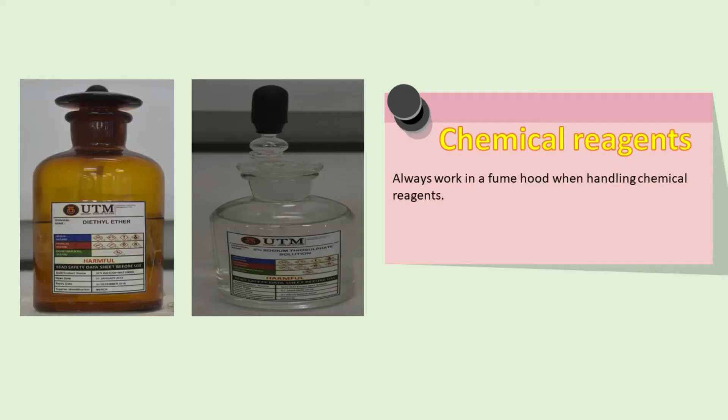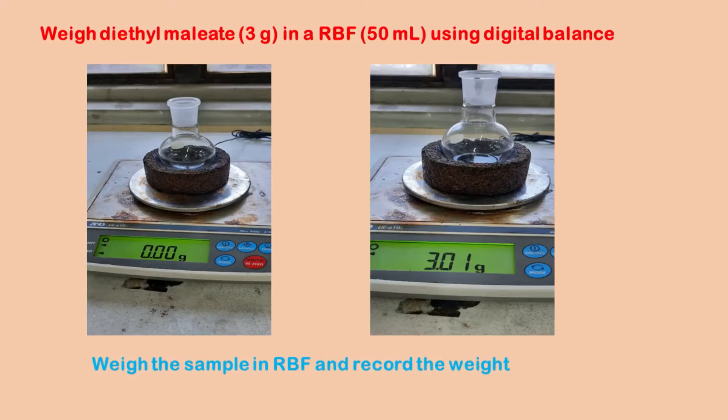These are the chemicals needed for this experiment. Weigh 3 grams of diethyl maleate in a 50 ml round bottom flask.